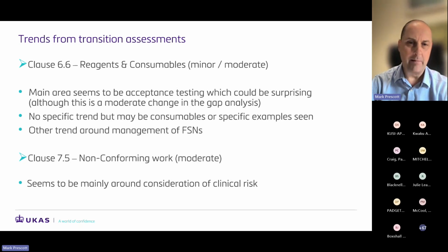Now, this is one of these areas where, if you've got gaps in your acceptance testing, it could well be that finding is more appropriate for the surveillance assessment. So we perhaps should be raising findings like that against the surveillance and not against the transition. So this is something we're having a little look at the minute, to see whether we are seeing findings raised against the transition when in fact they should be going against the actual surveillance assessment.